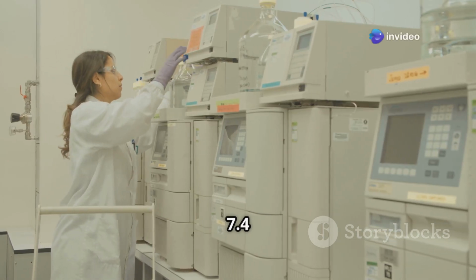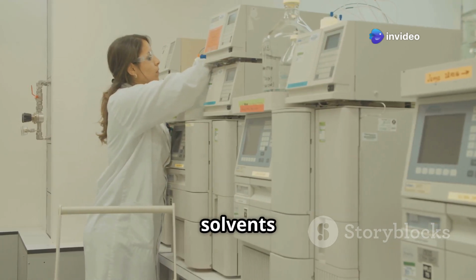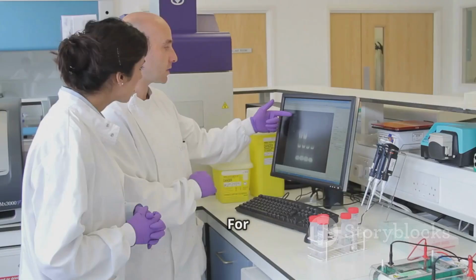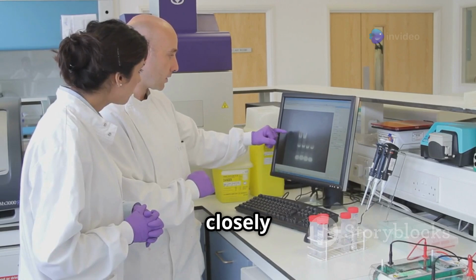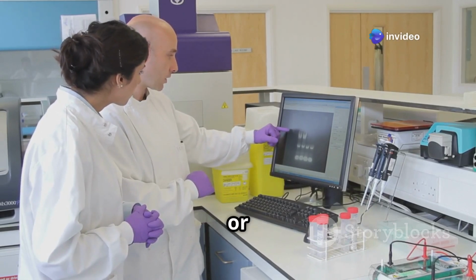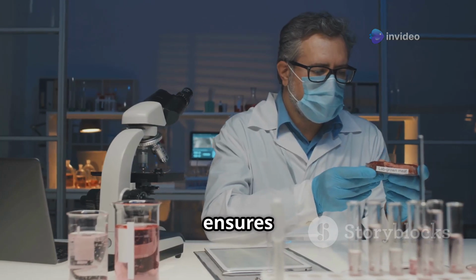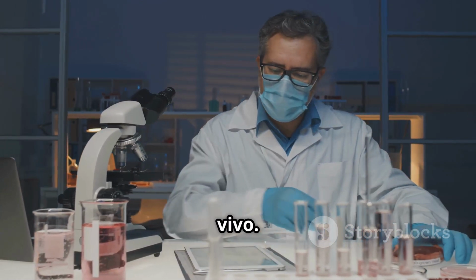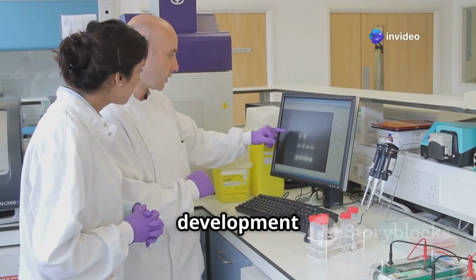Alternatively, a pH 7.4 phosphate buffer, ethanolic solutions, or organic solvents could be used based on the dissolution of the drug in the receptor fluid. For topical drug products, the receptor fluid for IVRT studies should closely mimic the conditions of the skin or mucosal surfaces. Selecting the appropriate receptor media ensures that the IVRT accurately reflects the drug's behavior in vivo. This is essential for obtaining reliable and meaningful results that can guide drug development and ensure patient safety.